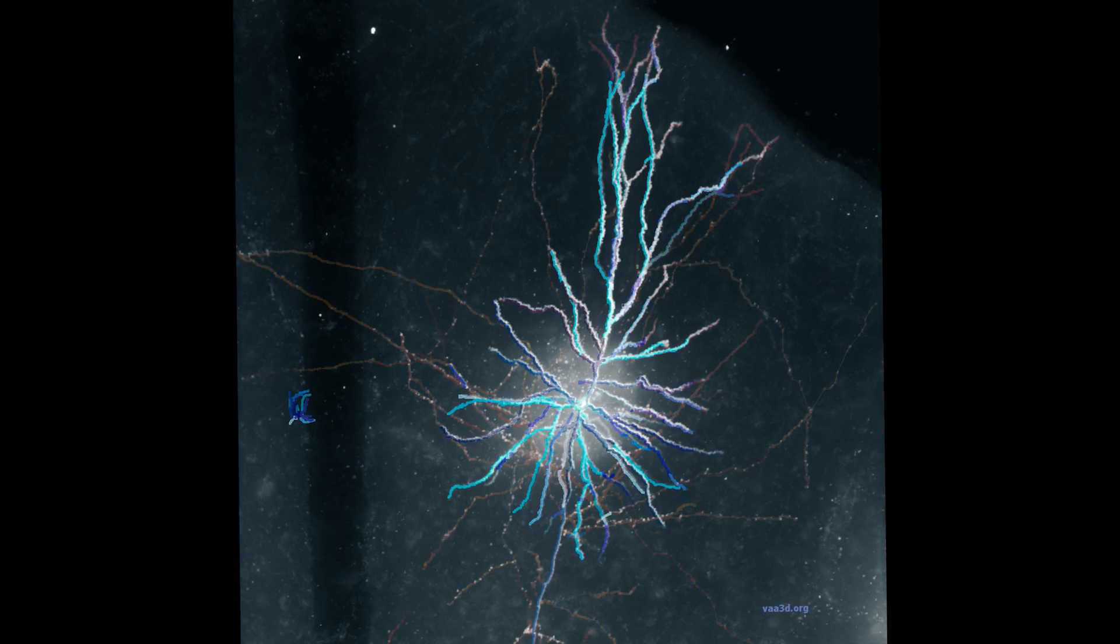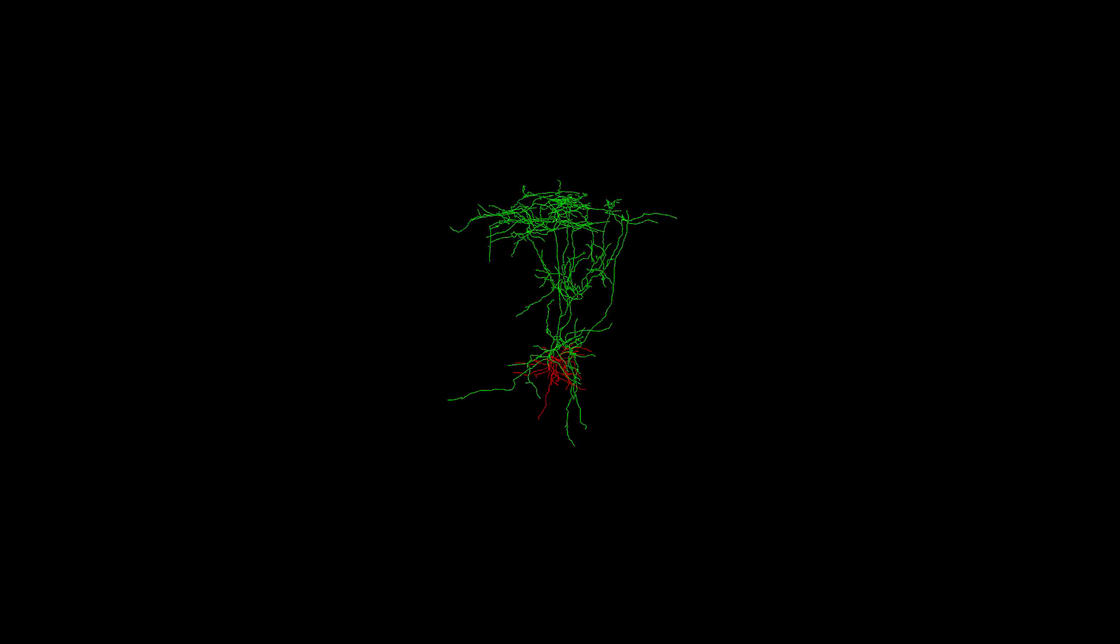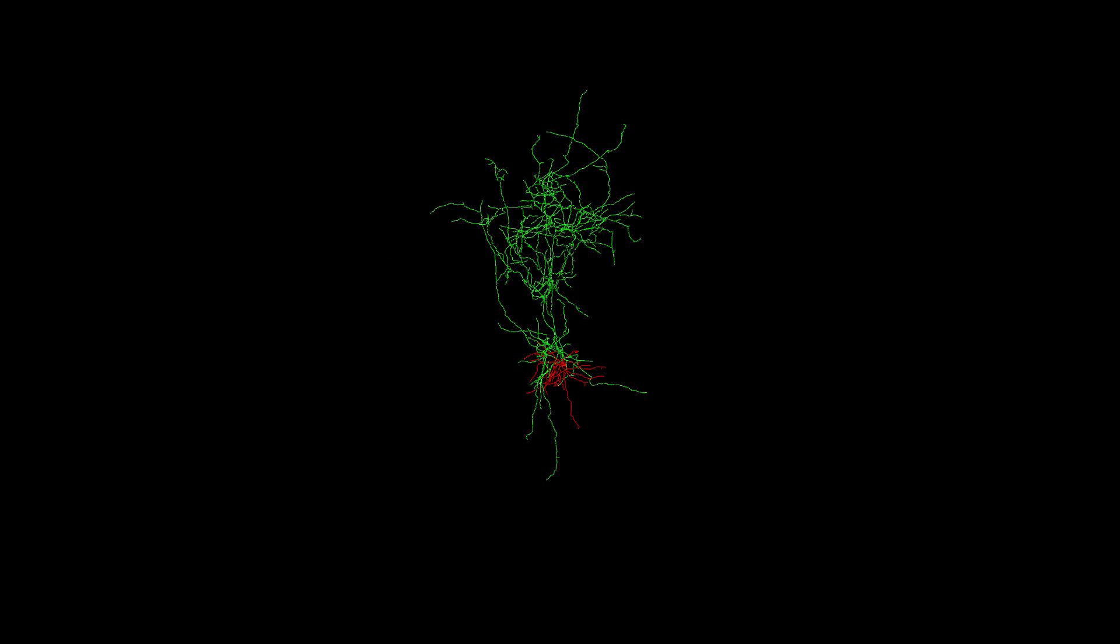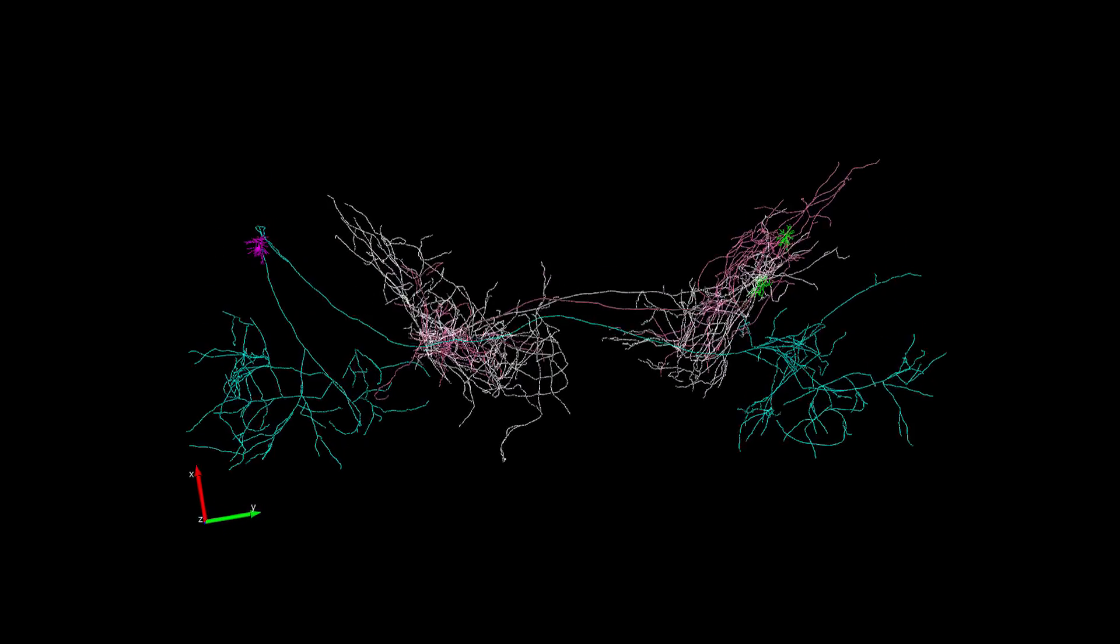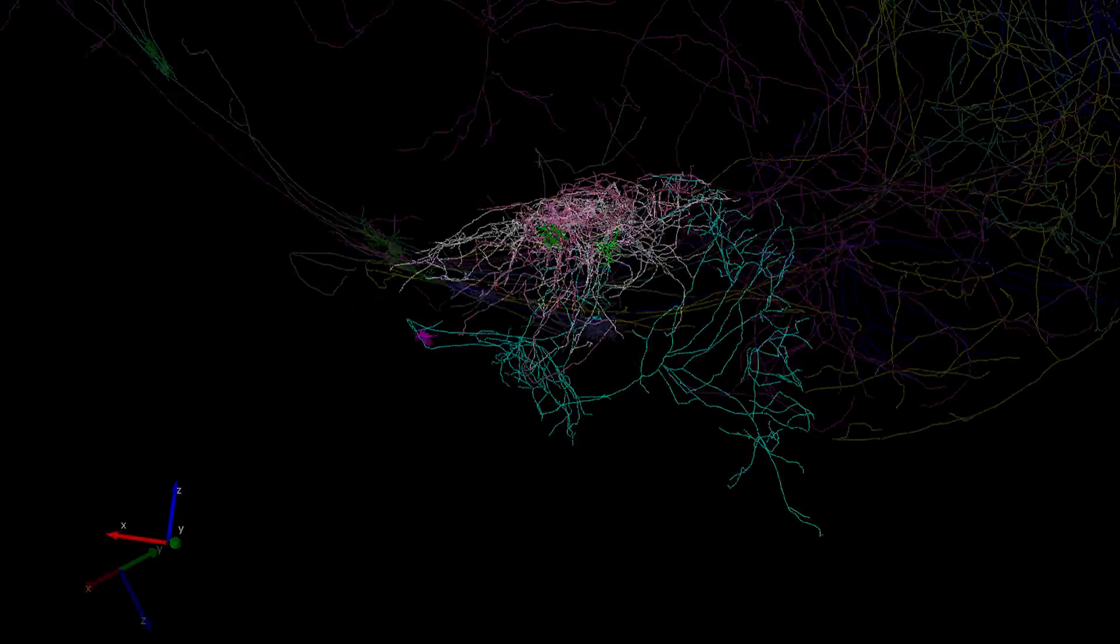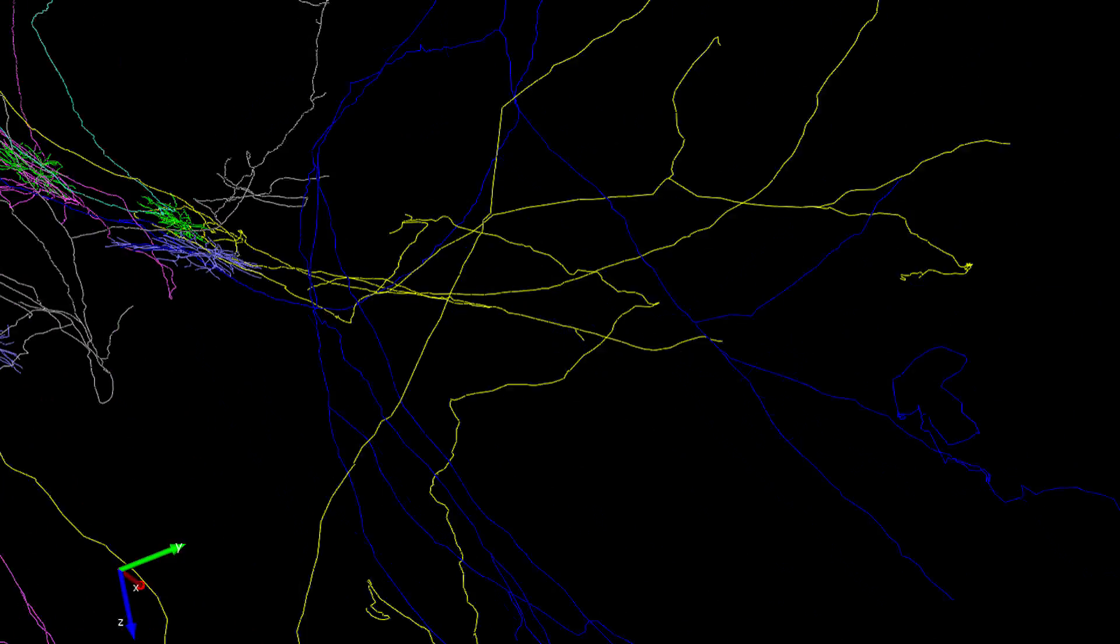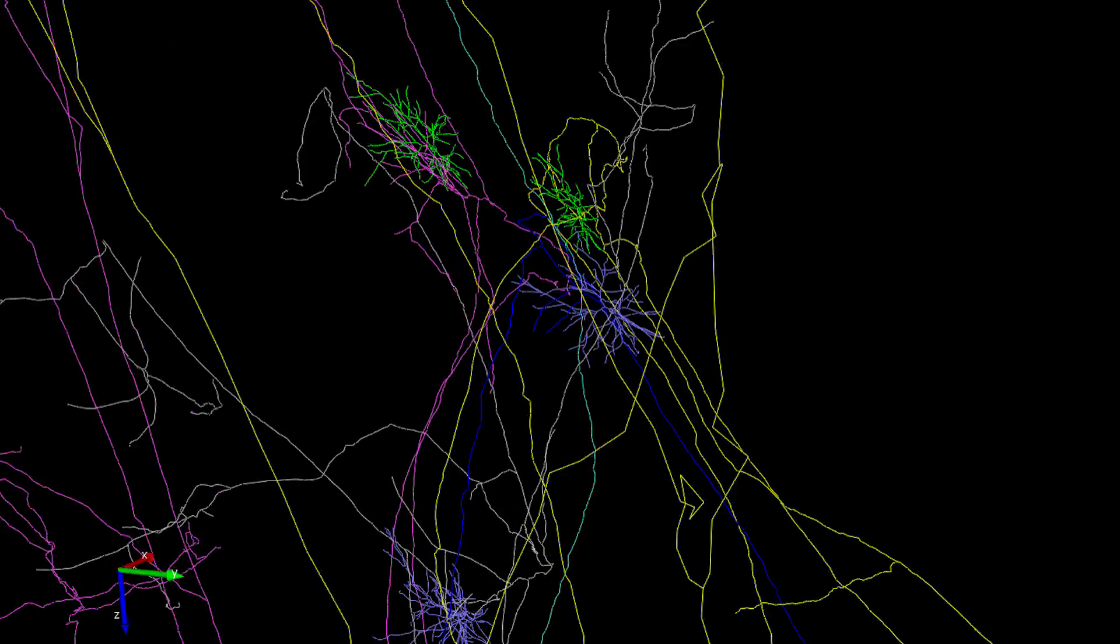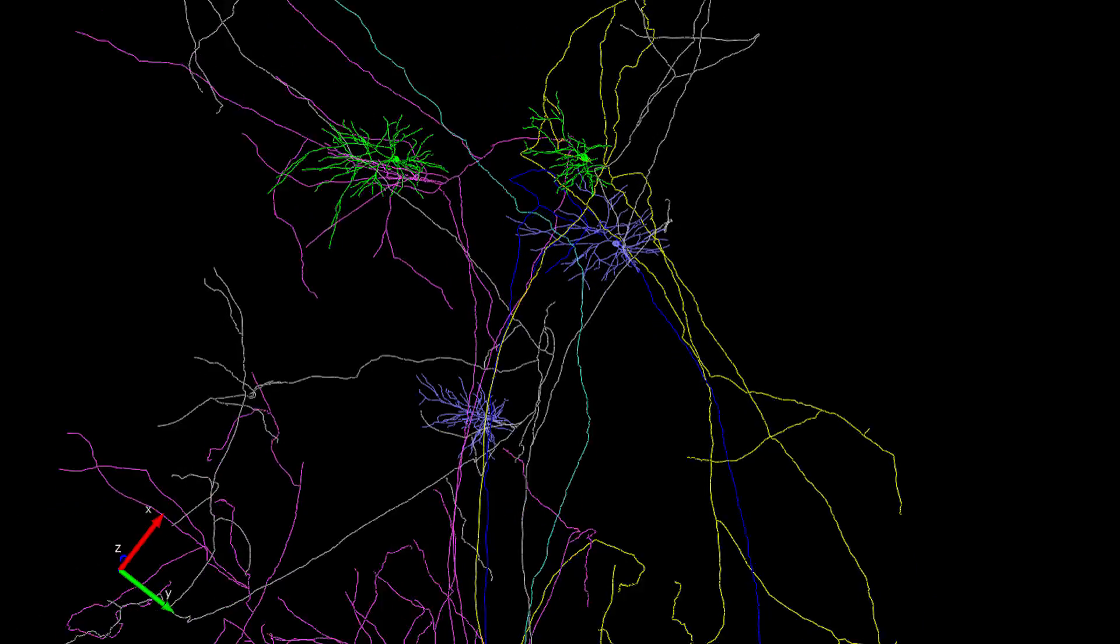The FMOS data will be some of the first descriptions of brain-wide single-cell morphology. For a long time people have been describing the morphology of neurons based on what they see in just a thin section, but now we have the technology that allows us to take high-resolution images and look at the morphology of the neuron across the entire brain.